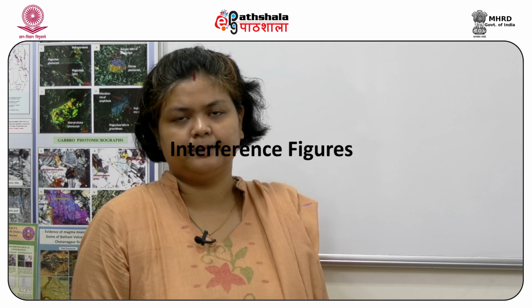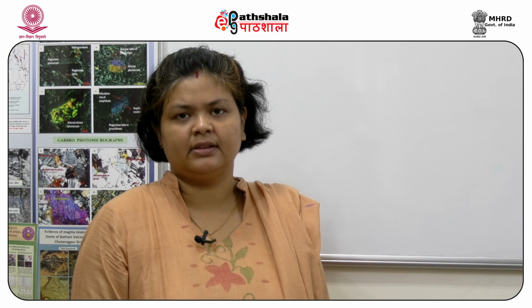I am Dr. Ashma Saikia and I will be discussing today interference figures. When an anisotropic mineral is observed under convergent polarized light with both the polarizers inserted, under high objective with the Bertrand lens inserted, we obtain a figure called an interference figure.